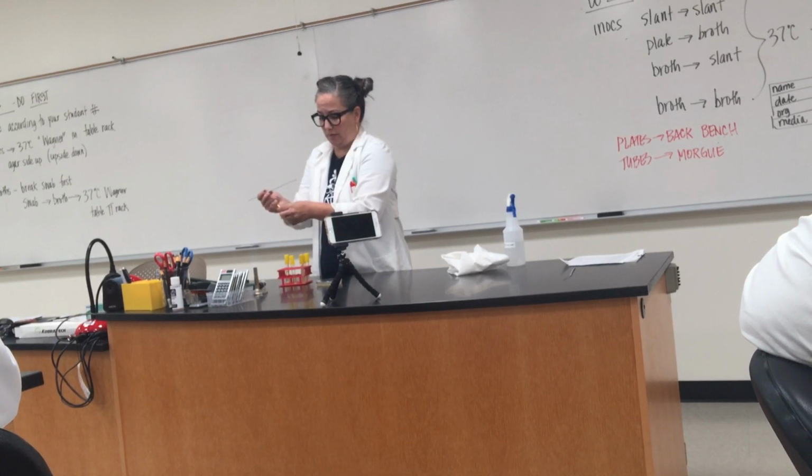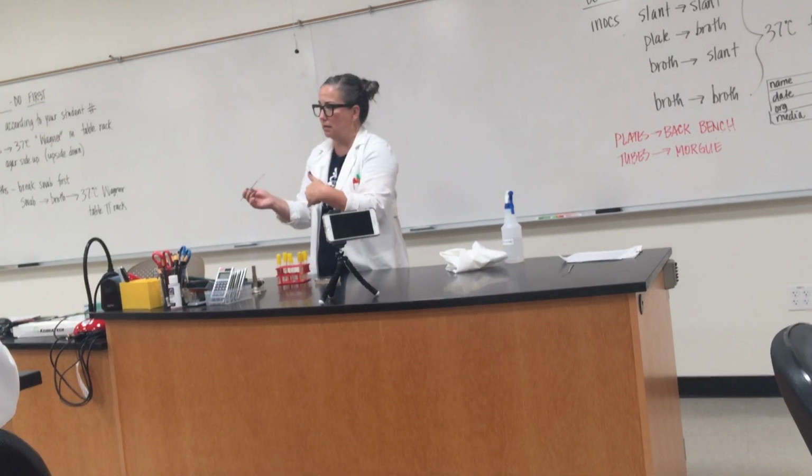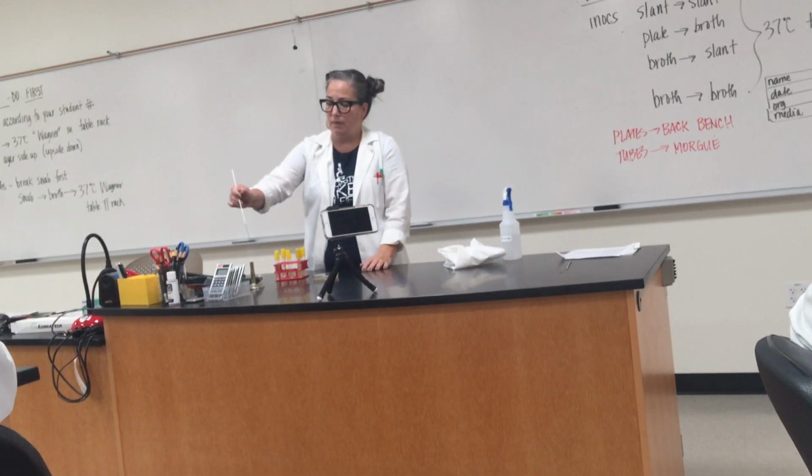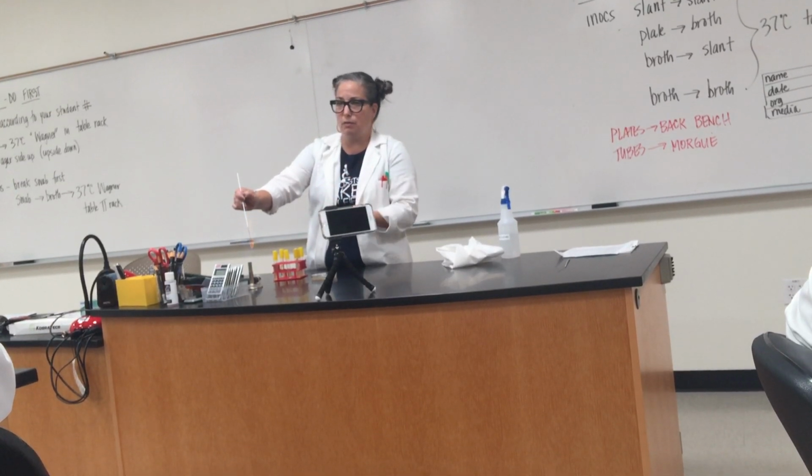You can also do that with the slant. You can actually just touch the surface of the slant, wait a second, and then grab some organism. The metal that's used in these loops heats very quickly and it cools very quickly.